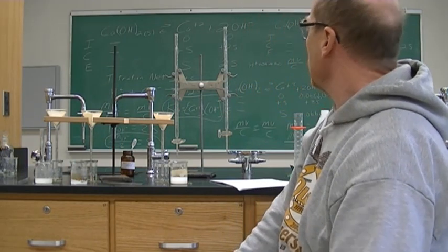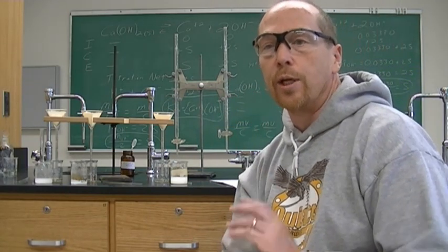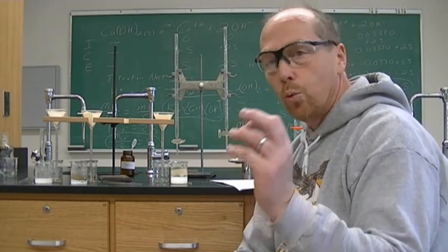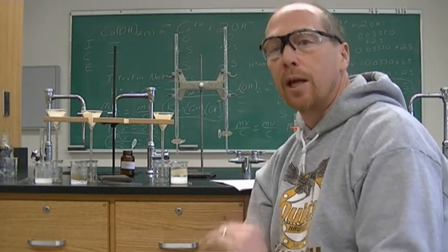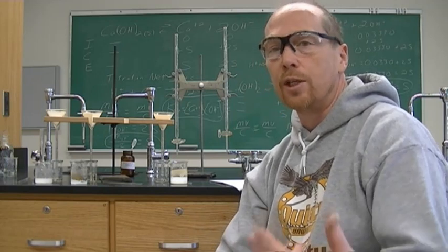I am going to use a burette just to make sure that we do not pass up the end point. It is very difficult here. You want one drop where it's a color, and then it is no longer a color. Again, if you went past it, it still is a colorless solution, versus the other titration where you have no color going to a light pink. If you added way too much of the base, it's going to be a dark pink. You would know that you went way too far.